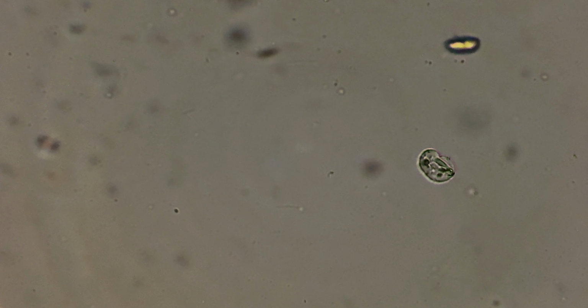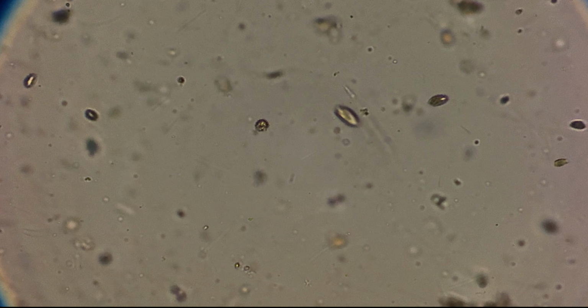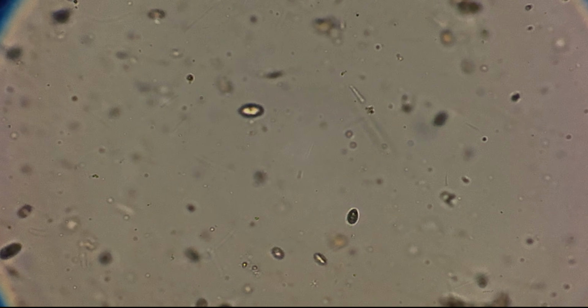I can't tell you exactly what species we're looking at. Without lab testing, we really can't be 100% sure. But look at that movement. That is life. Real, active, moving life. Now let's bring in the kiwi.